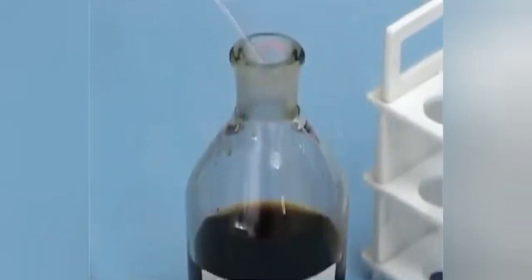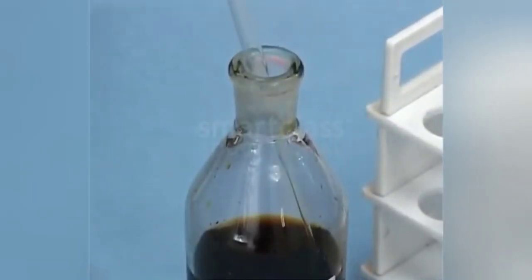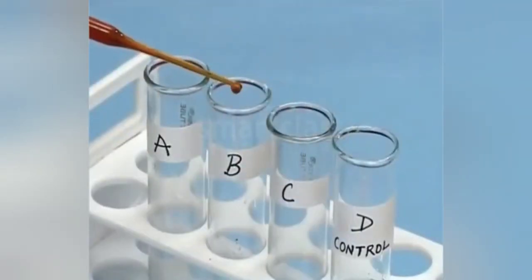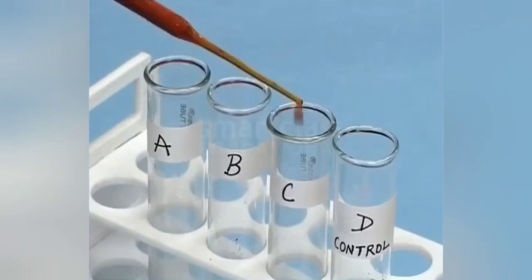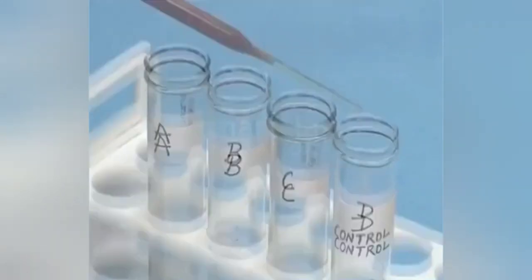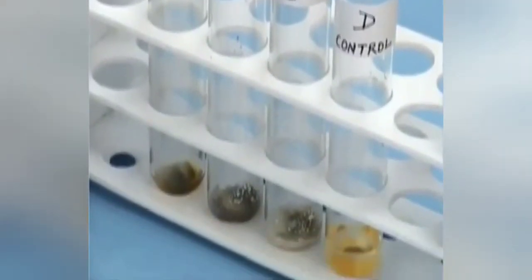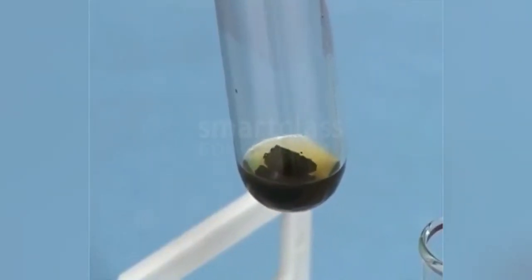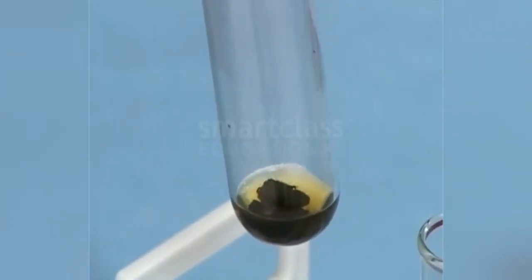With the help of a dropper, add a few drops of iodine solution in each test tube. Now wait for 1 to 2 minutes and observe. What do you observe? The potato piece in the test tube A turned blue-black.